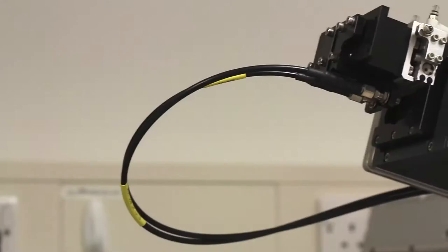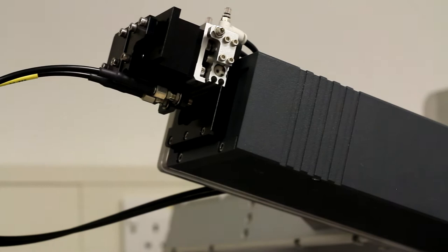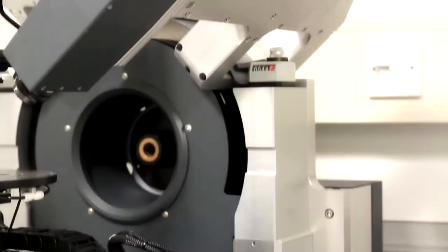The Semilabs SE2000 consists of a polarizer arm which houses the xenon lamp emitting a broad spectrum of radiation from the UV to near IR, with a system of optics that allows for the generation of the focused beam of known linear polarization.